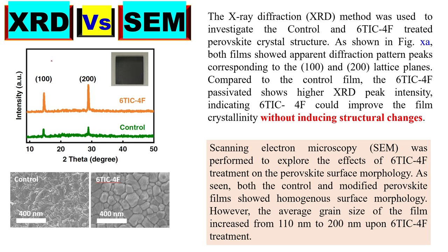How to describe XRD graphs and how to describe SEM graphs. These two techniques, the X-ray diffraction analysis and the scanning electron microscopy analysis, must support each other. The results, the findings from these techniques, must follow each other and support each other. So let's get started. This is the XRD graph for two different samples.